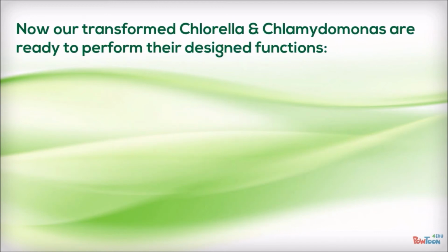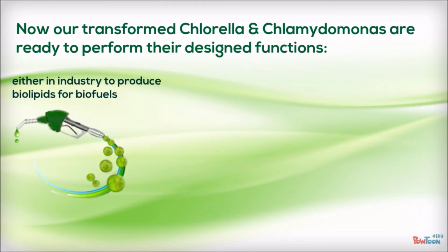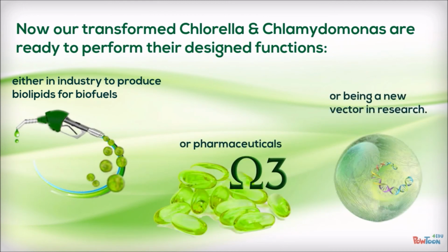Now our transformed Chlorella and Chlamydomonas are ready to perform their designed functions. Either in industry to produce biolipids for biofuels or pharmaceuticals, or being a new vector in research.